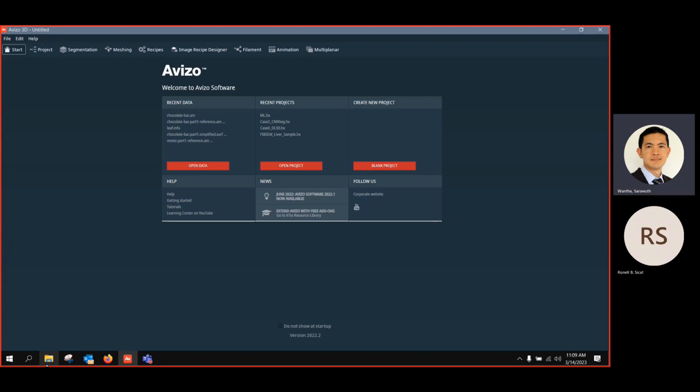So the first 2 days we do basic segmentation, manual segmentation, and some advanced segmentation already. Today we will focus on mostly the new advanced stuff. So it's called extension. As you see, so far on the previous 2 days, we did just the core segmentation or the module that we use. But today we're gonna focus on how you can use these packages called extension.